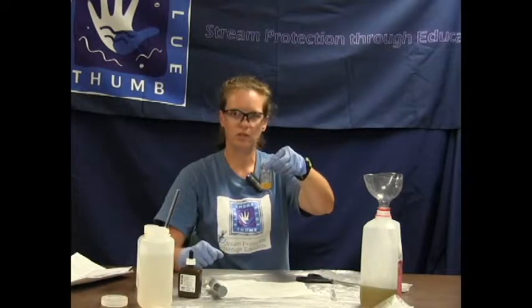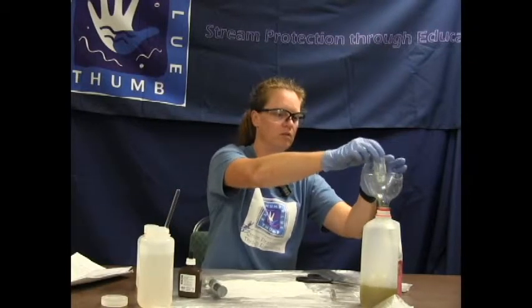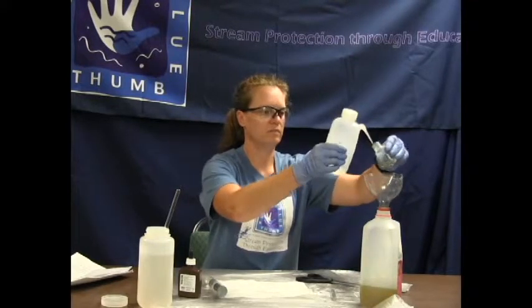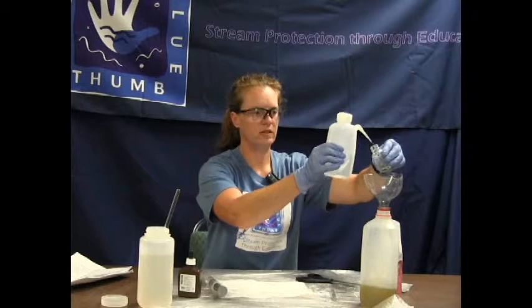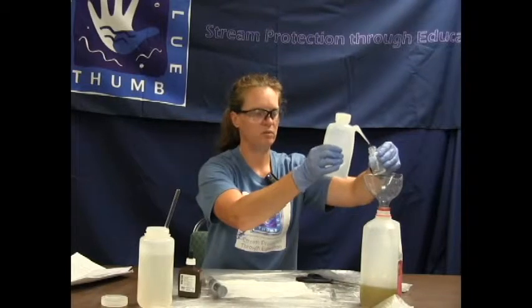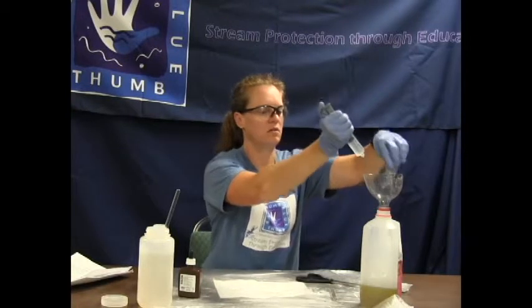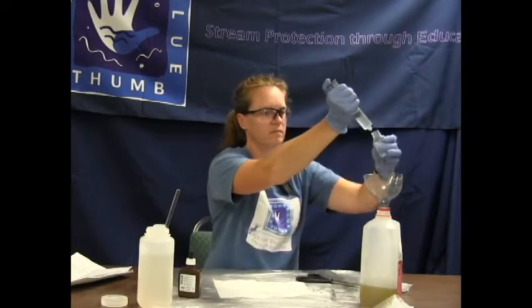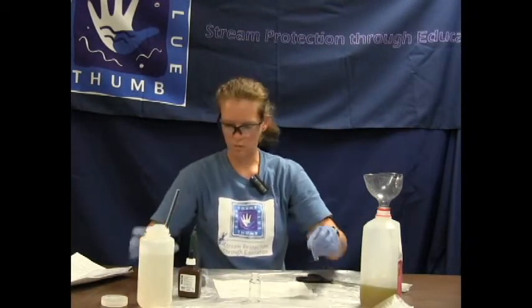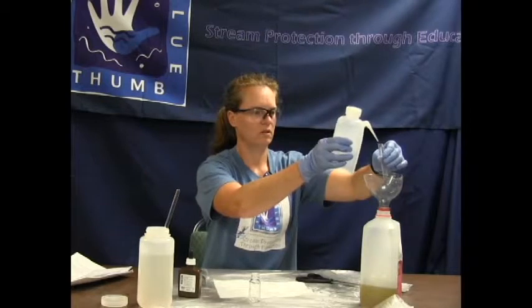Then we would repeat the process for our second test to make certain that we get repeatability. We will clean up our equipment again. For the chloride test, you want to be within at most 2 drops difference to have repeatability between the 2 creek water tests. We will rinse out our tube as well, just to stay clean even though it only had creek water in it.